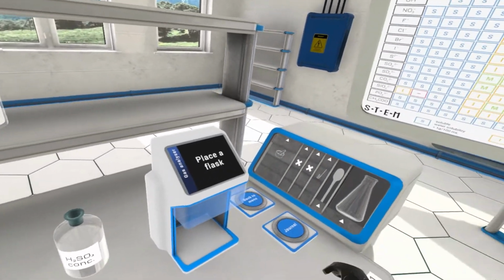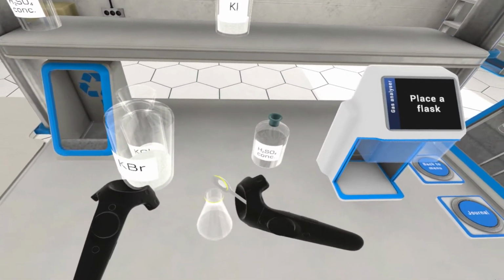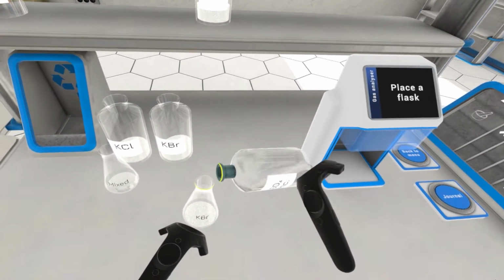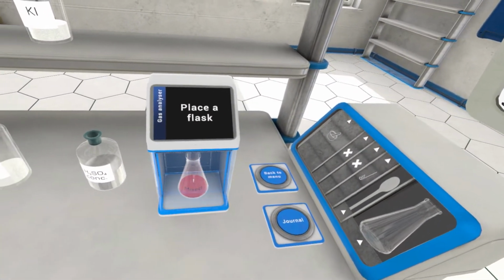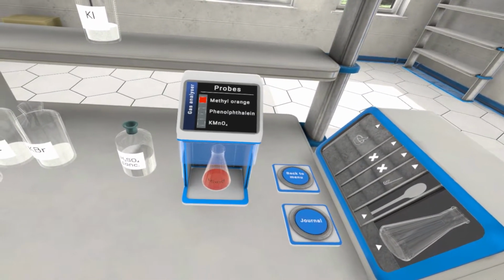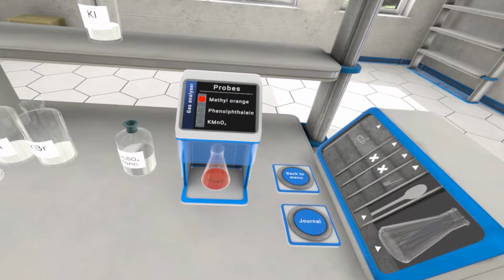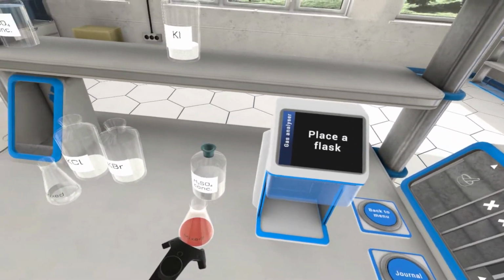Put potassium bromide in an empty flask and add sulfuric acid. The bromide reacts with concentrated acid to form an orange solution and gas. The gas has acidic and reducing properties. By the color of the solution, we can assume the formation of bromine, and by the acidic properties of the gas, the release of sulfur dioxide.